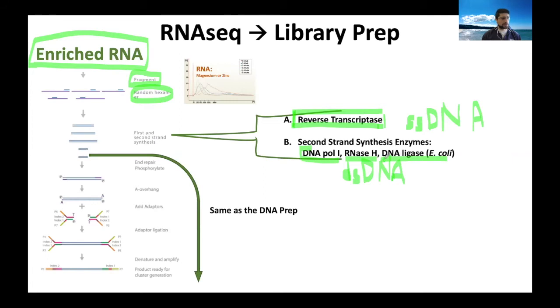And so what you basically end up with is short fragments of second-strand DNA on the first strand. So here's the first strand, and this is the second strand. You see you have these little pieces of DNA, and the DNA ligase is actually linking these all together, okay?